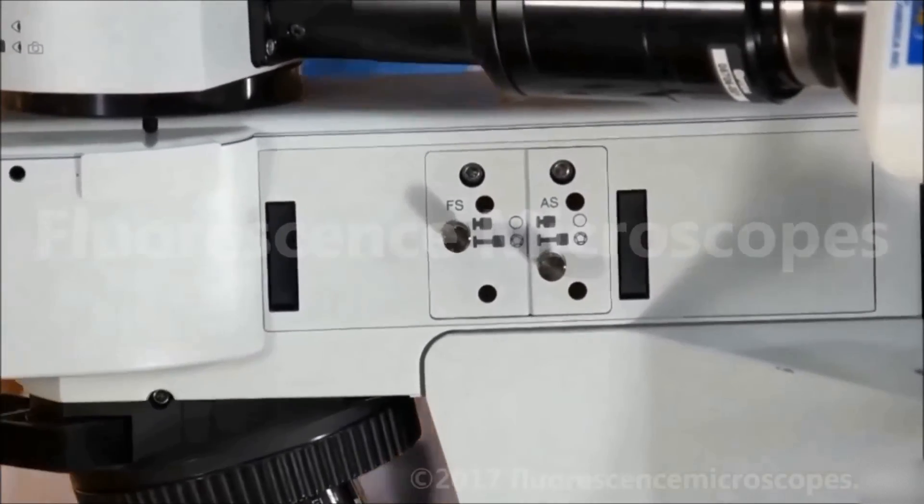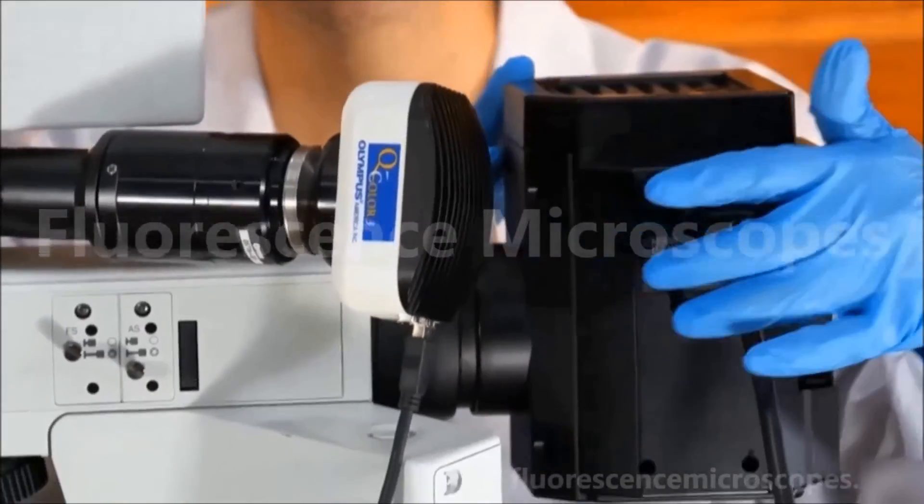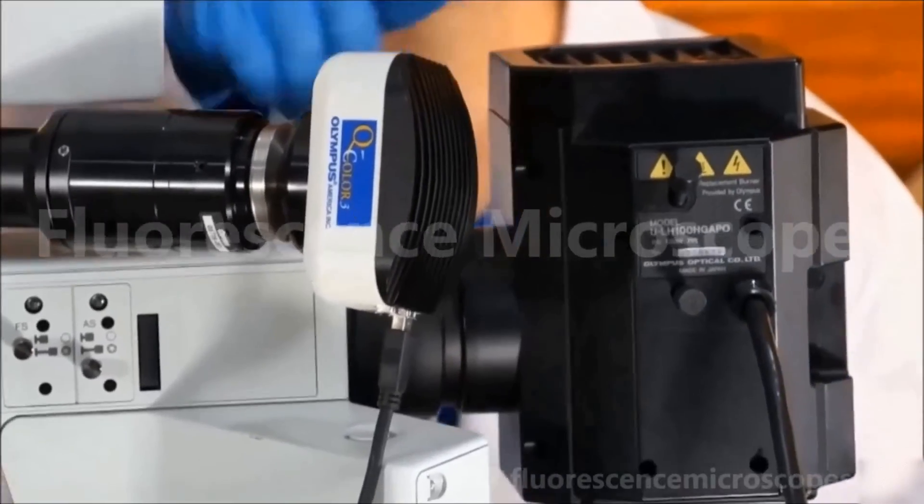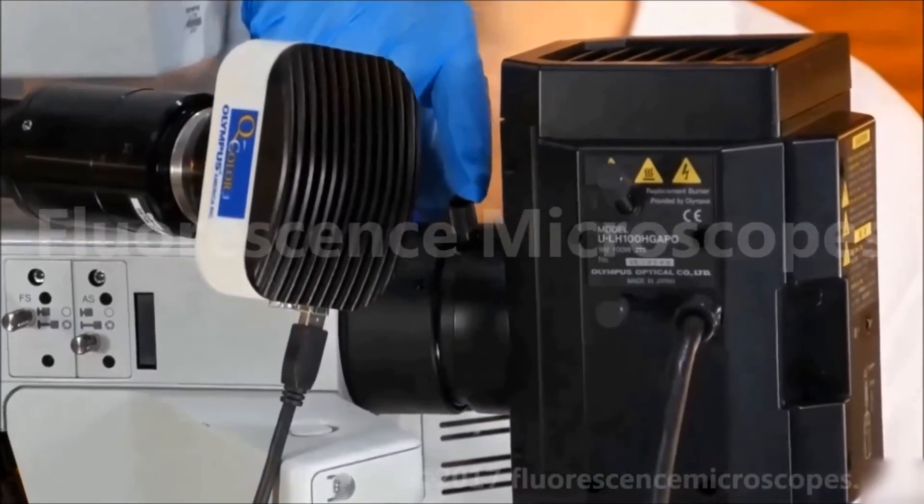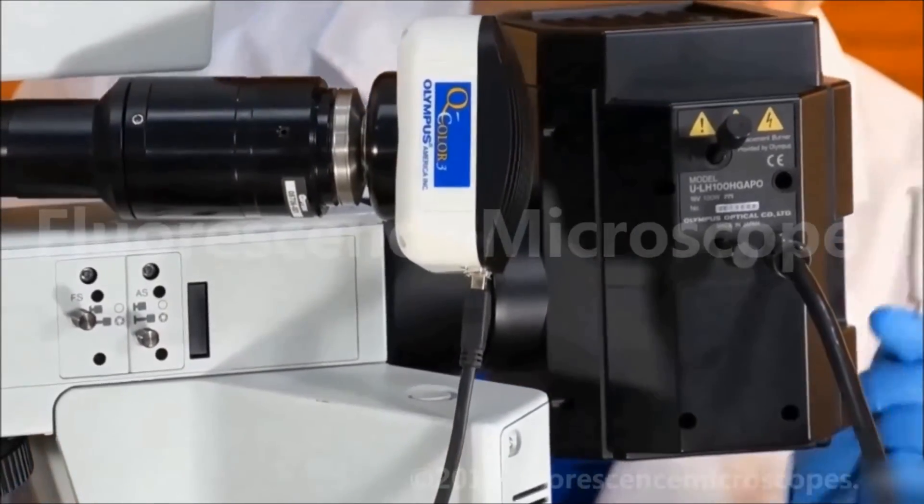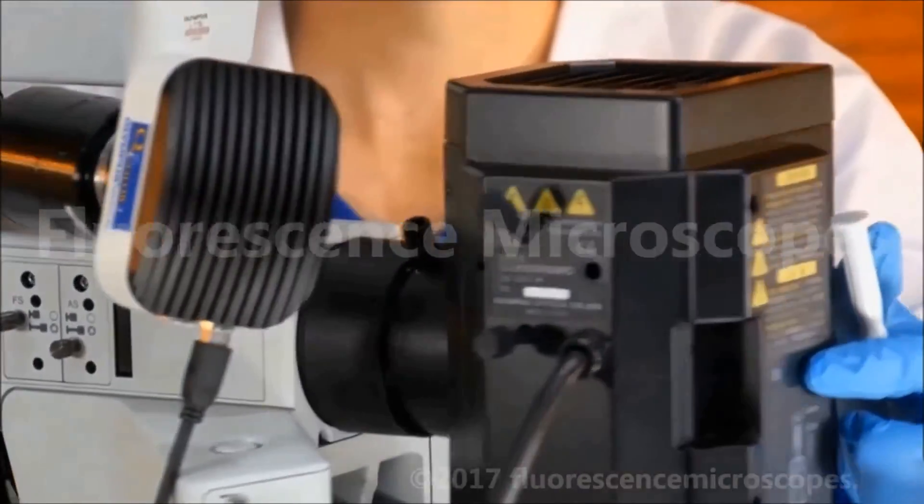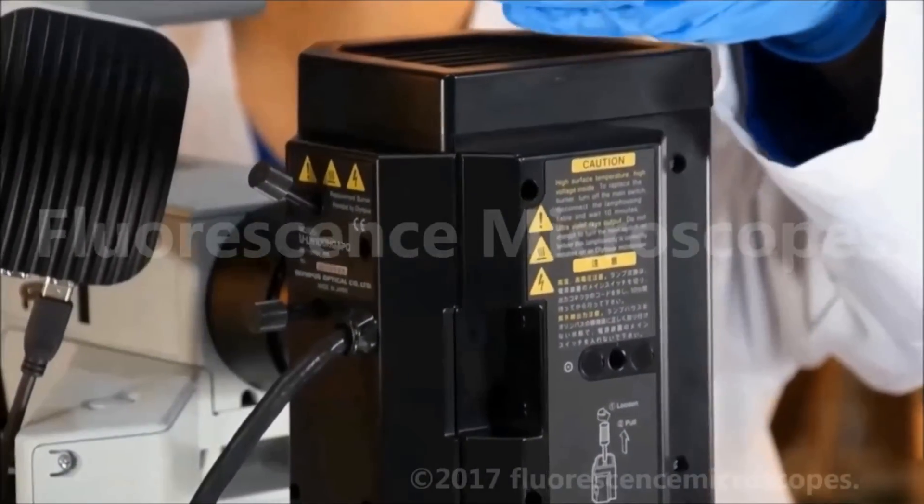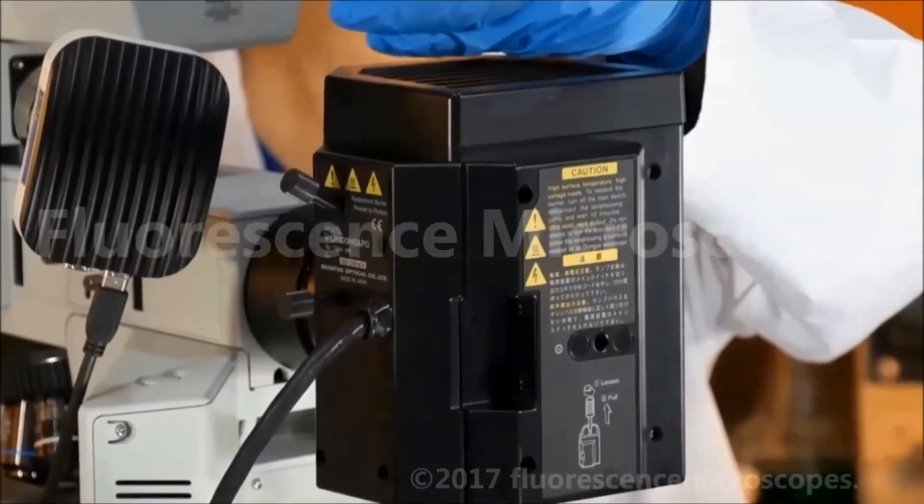You have on your HBO lamp housing, you have two knobs for centering your bulb. Plus you have a collector knob and a collector focusing knob. There is one additional knob, if need be, at the very back of this lamp housing. It moves the reflector in and out.